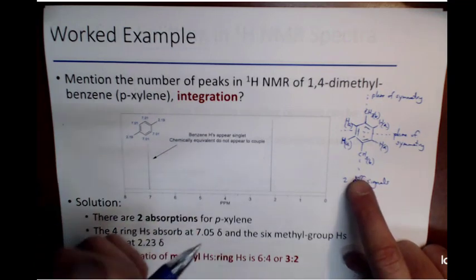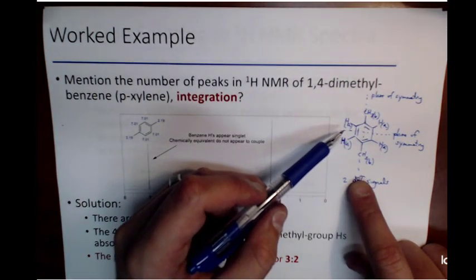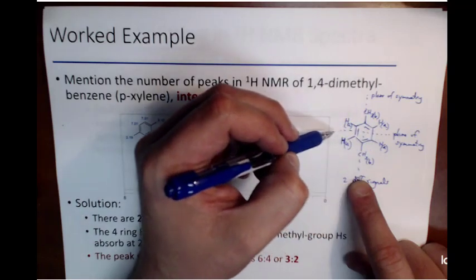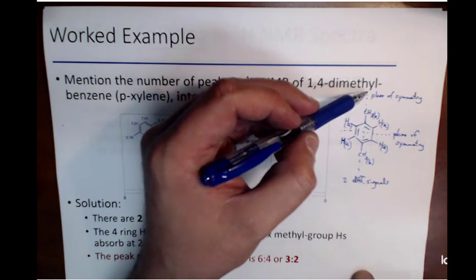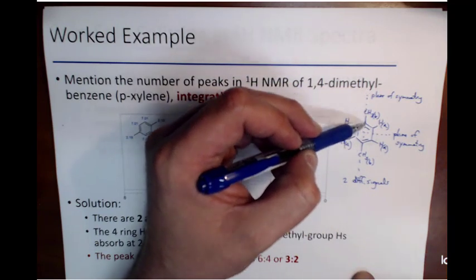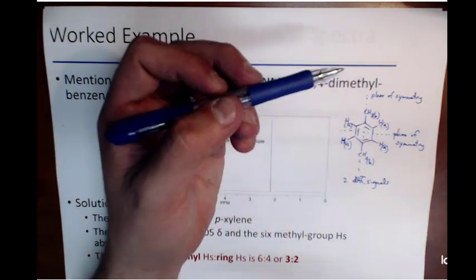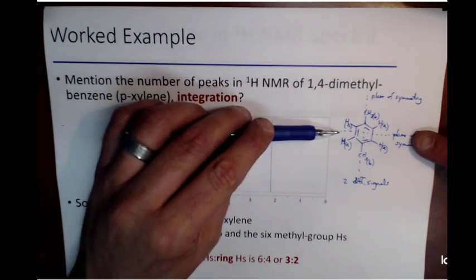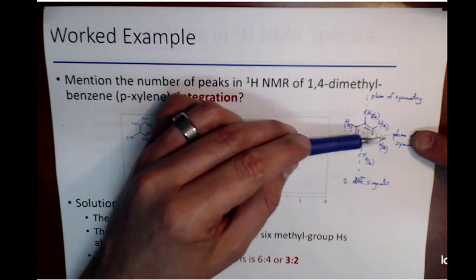And so specifically, when we look at me drawing that 1,4-dimethylbenzene, you can see that I actually have 2 planes of symmetry in my molecule. I have one where I can cut through the bonds in the benzene here, or I can cut along these carbon-carbon bonds for our methyl groups coming off the benzene. So I have 2 planes of symmetry. And what does that tell me? Well, based off of this plane of symmetry here, this hydrogen and this hydrogen are the same, so HA, HA.